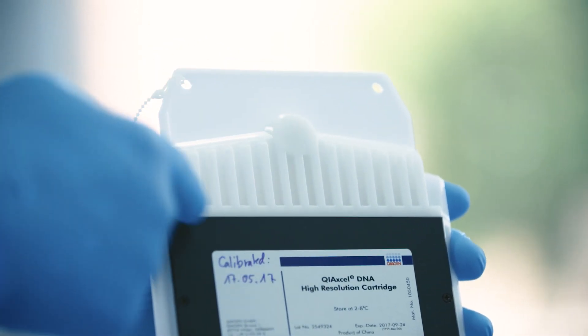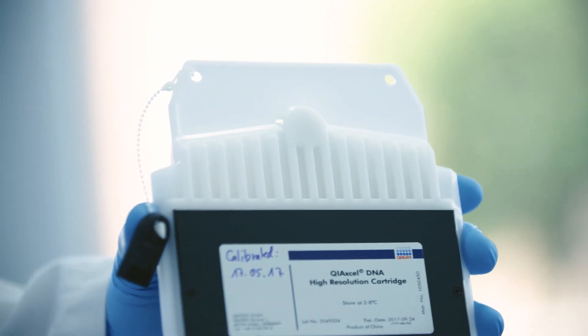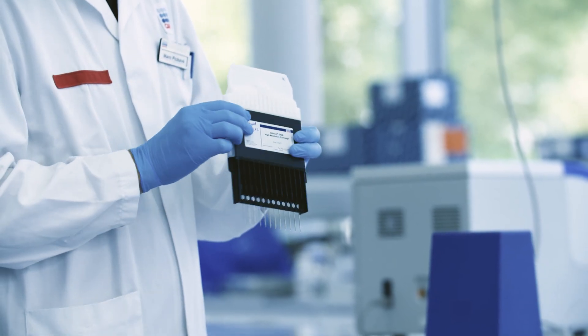The gel reservoir of the cartridge contains the gel used for the run. The gel is replaced for each new run.